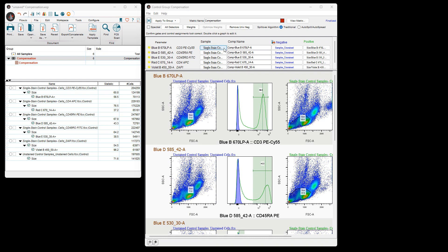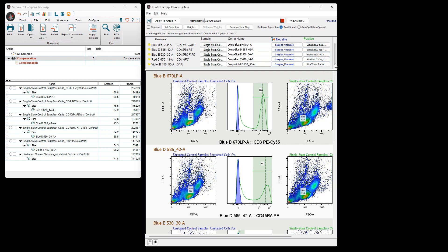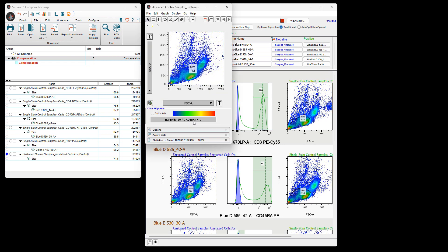FlowJo has created gates and histogram markers for each single positive control. You will evaluate each plot and gate on those plots. If a gate needs adjustment, you will double-click on the plot to open a new window, make the change, and then close the window.